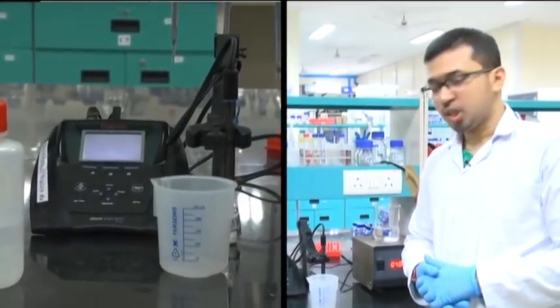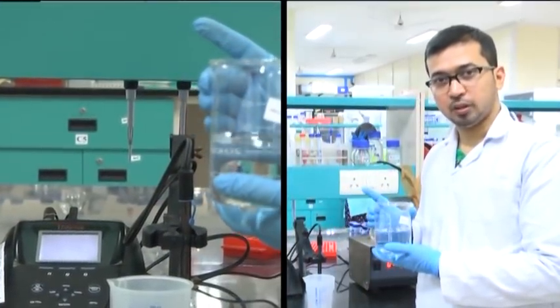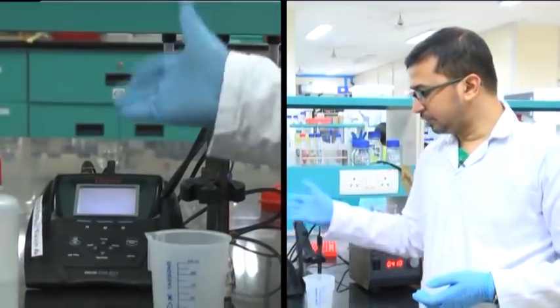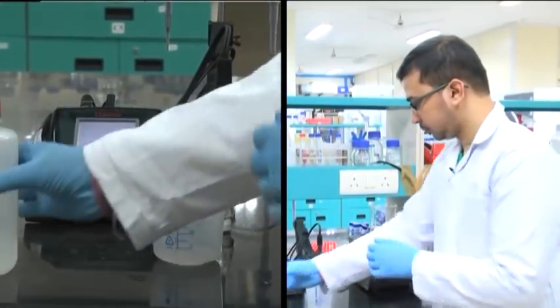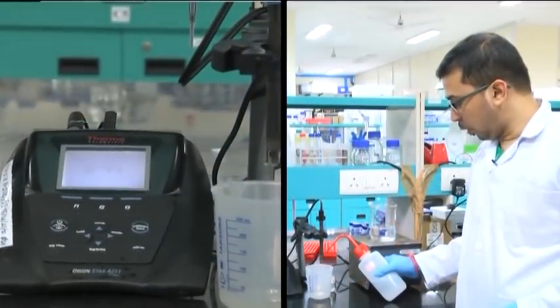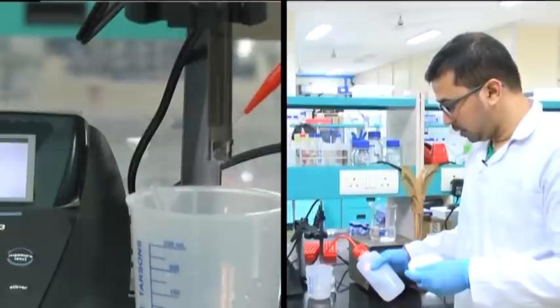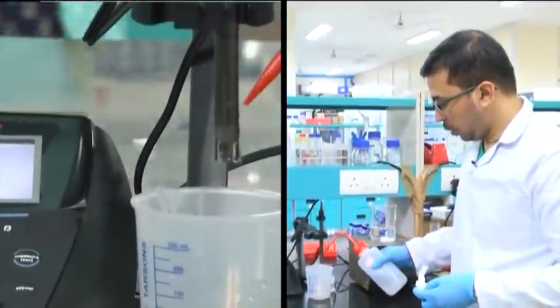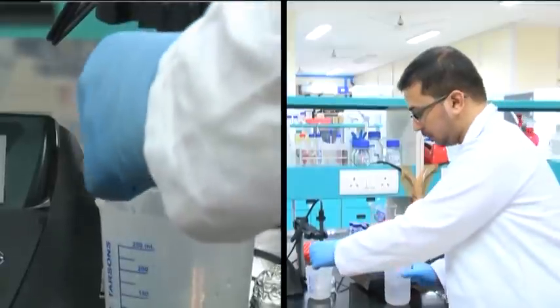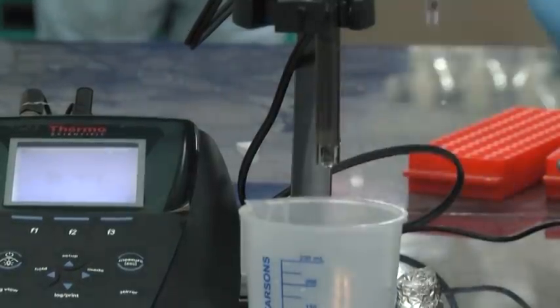Now we will check the pH of sodium hydrogen phosphate monobasic — the one we have prepared and dissolved in double distilled water. This is the pH meter, as we have seen earlier during the Tris buffer preparation. We will wash the bulb with double distilled water, wiping it with a clean tissue paper. We have to repeat this procedure 2 to 3 times carefully.